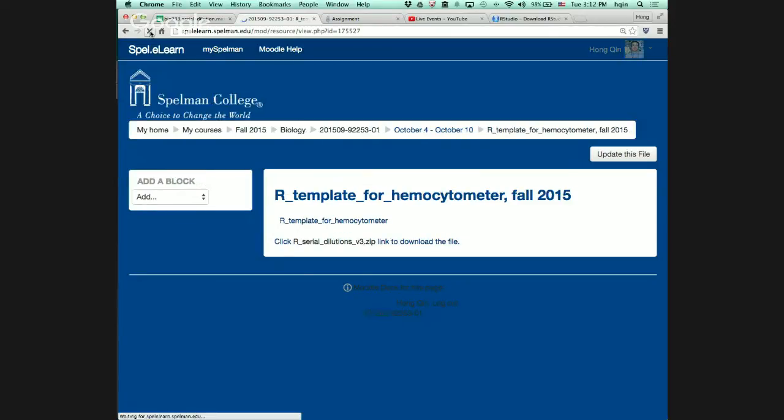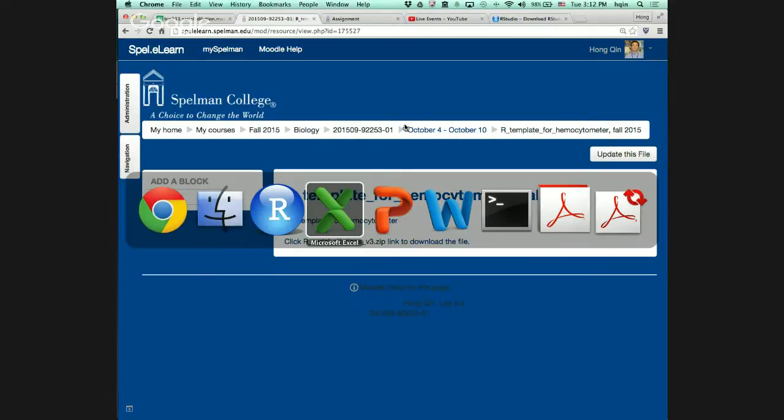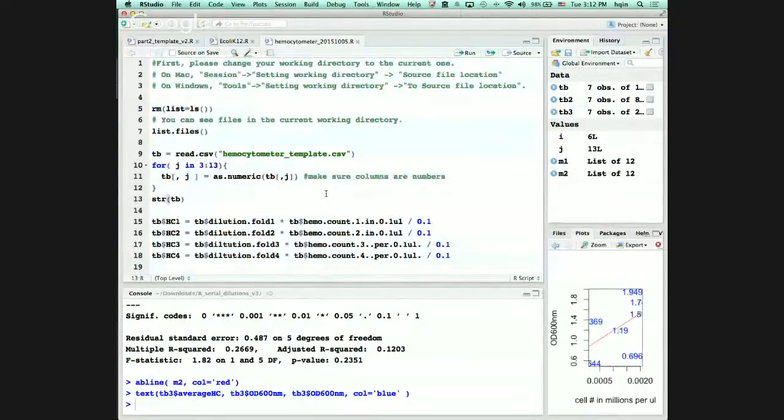Okay, I just updated it again. If you're already running, it's okay though. Some of the students apparently cannot read the Excel file, so I changed the data file into a text file. That's the only thing I'm changing now. In any case, after you read it in, the only thing that matters is how that file is read into there.